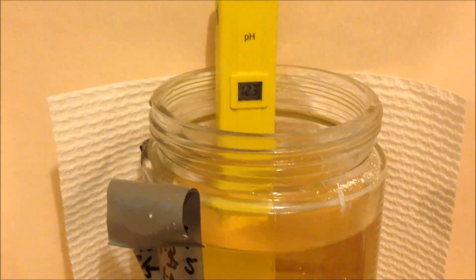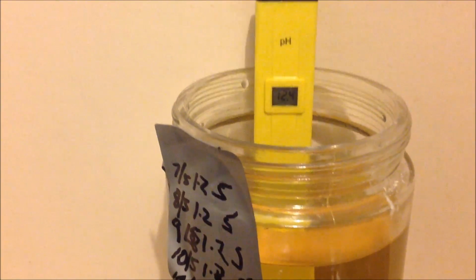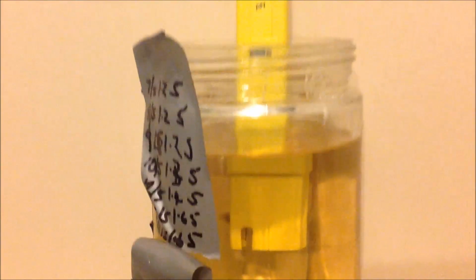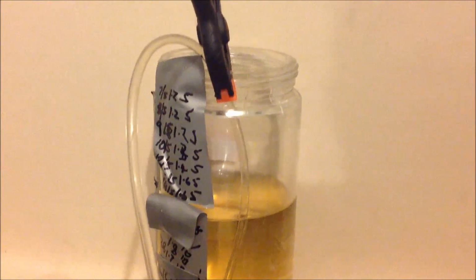128.2, been sitting at pH 12.3 since about the 19th, and it's the 28th today, so it's about 10 days. Nice and clear, so I'm going to rack that off and discard the precipitate.